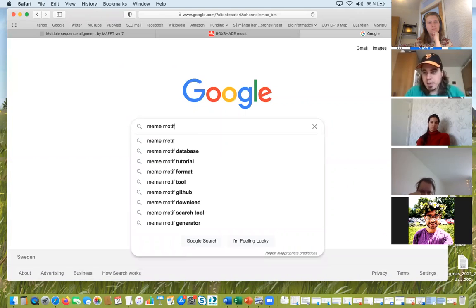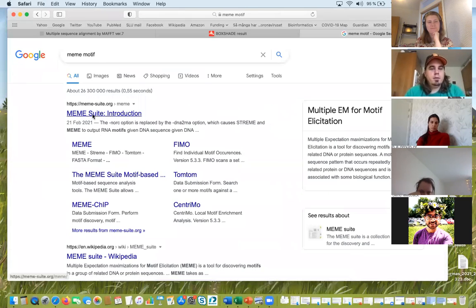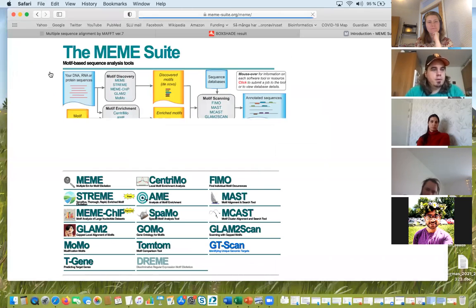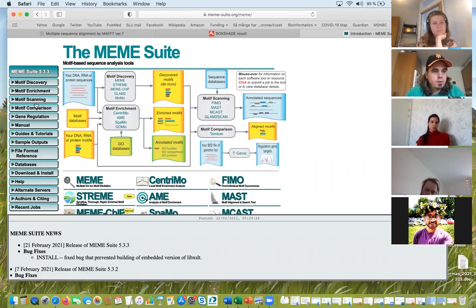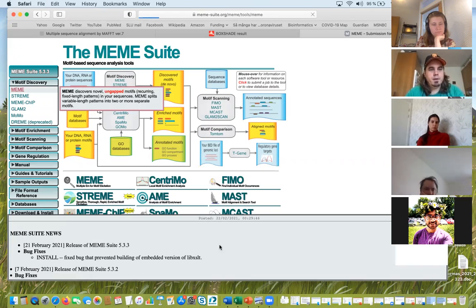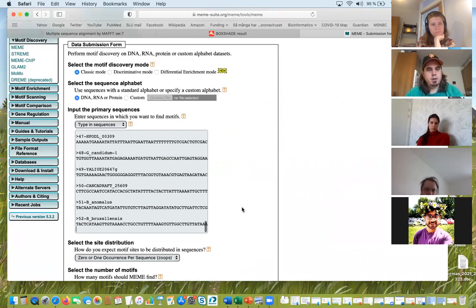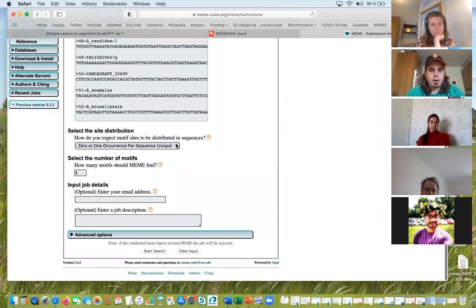Because if I search for meme, I'm going to get half the internet. There we go. I want motif discovery. There we go. Type in sequences. I want any number. Give me 20.